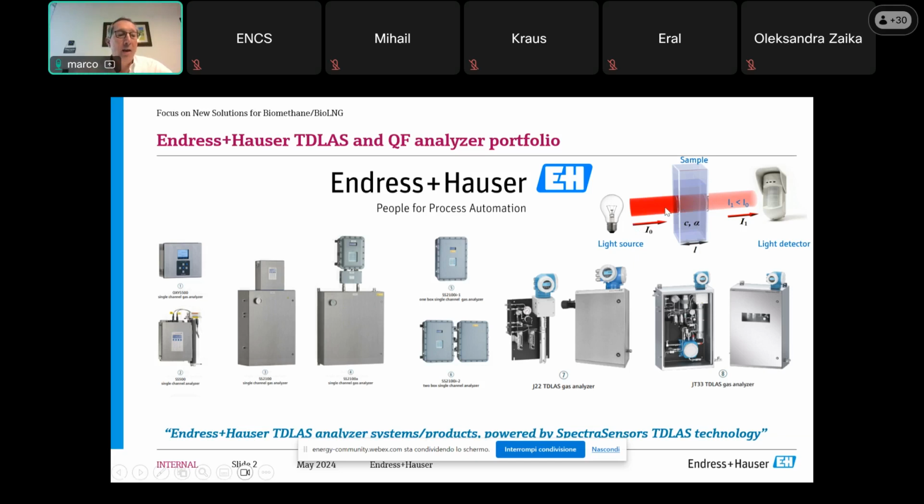In this way, the measurement is free from interferences and very stable, because the laser diode is an electronic device, so its correct behavior is influenced only by the current I send to it, and it is extremely stable over its whole life because the power required is very low.